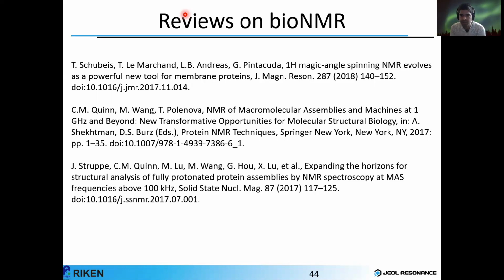All right. So the next question is, would you say ultra-fast MAS could be beneficial for half-integer quadrupolar nuclei as well? Yes. The one thing is, if the quadrupolar coupling is very large, we still see huge second-order broadening. In this case, we can use proton detection to observe the full line shape. And in addition, even if we have much narrower lines, we can observe the central transition line and satellite transition line to obtain the quadrupolar coupling. I think even for the half-integer quadrupolar nuclei, proton detection is quite beneficial.